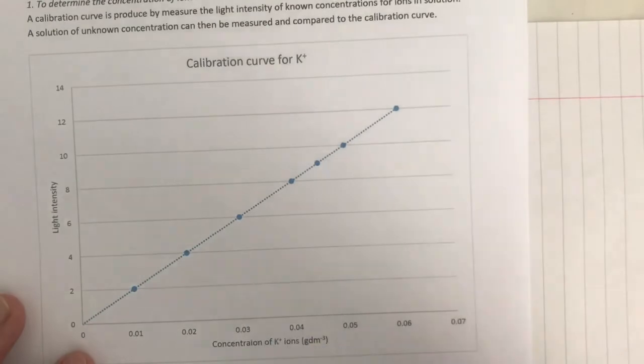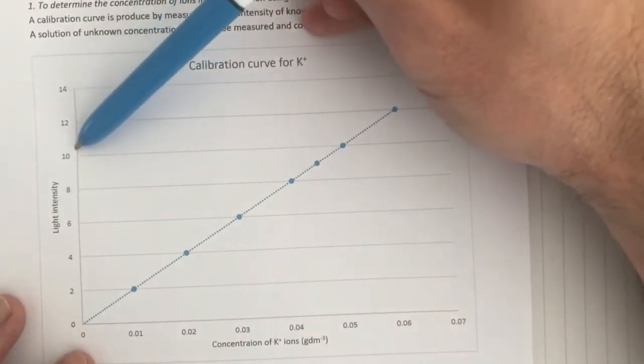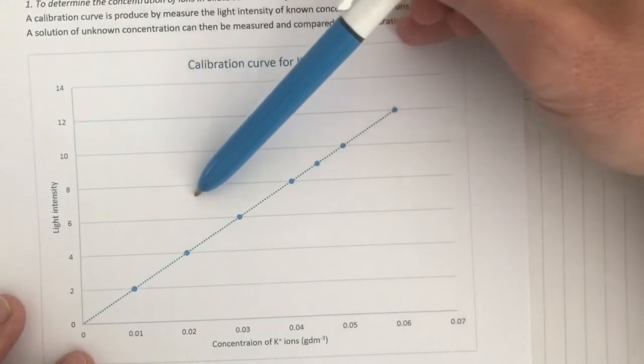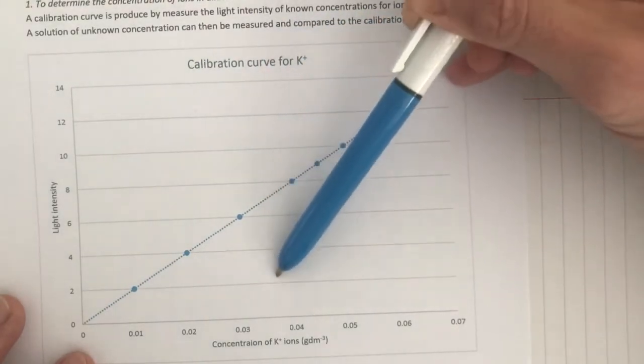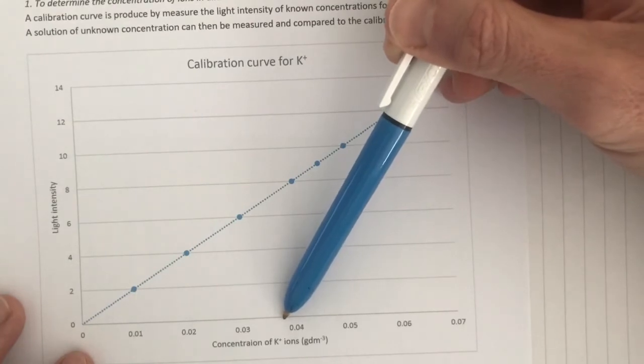Okay? What this means you can now do is you come along with an unknown sample, and you would measure the light intensity from that sample, and then you would take that reading back to the calibration curve, and you would work out the concentration that you had present in the sample.